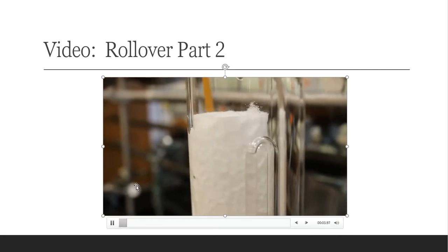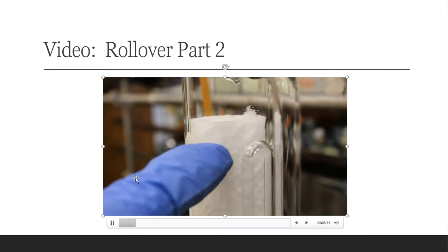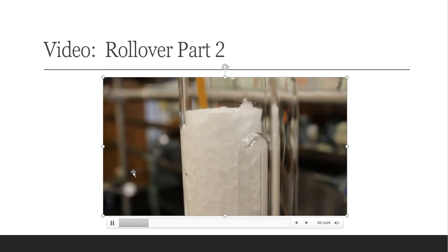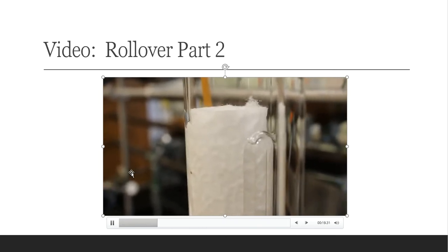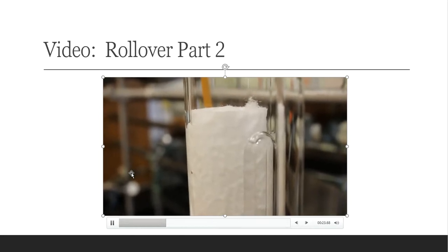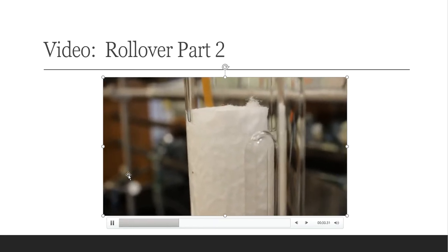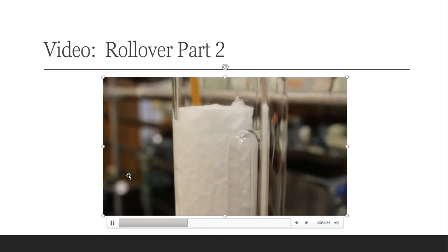So a rollover is about to happen. I can see that the liquid layer is right here, right at the neck of this thing. So this is kind of preempting the actual rollover that will begin to happen. Hopefully we can catch this rollover on film, because I want you to see the actual rollover that happens in the Soxhlet at that point. So I'm going to shut up for just a few seconds. We're going to sit here and watch, and see if the rollover begins to happen on camera.